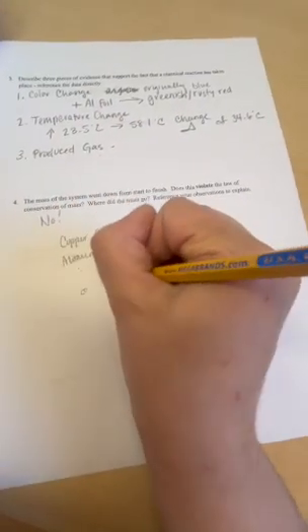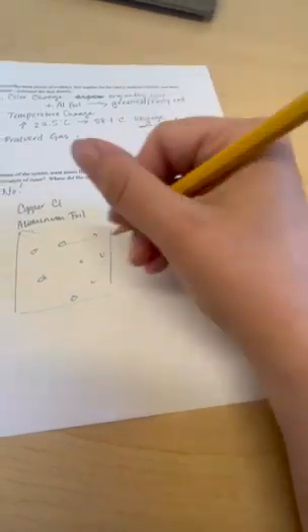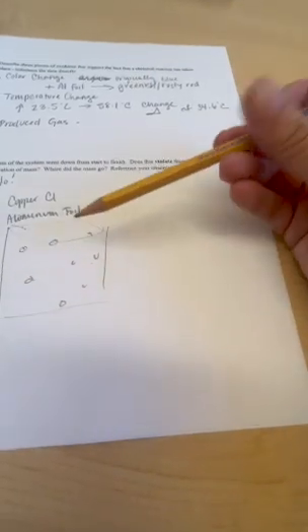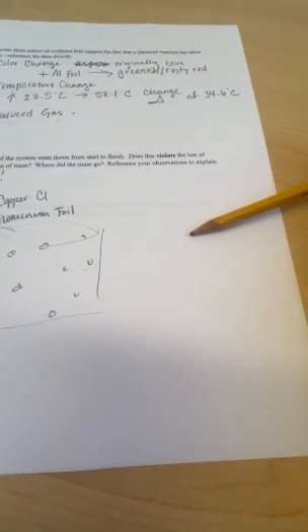It looks like a bunch of these broken up pieces within this beaker, right? We've got that solution there. So we're making a heterogeneous mixture because we can see pieces of the aluminum foil, we can see deposits of the copper. But just because it doesn't look the same doesn't mean we lost anything, right?